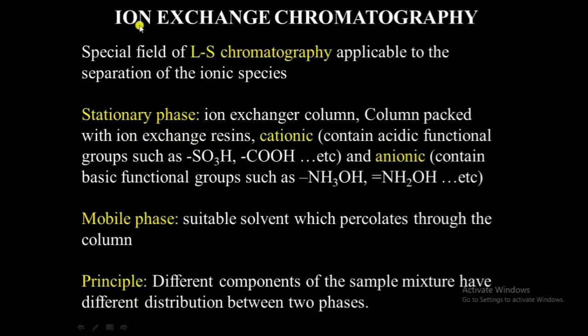So first we will see what ion exchange chromatography is. From the term itself, ion exchange, we can understand that an exchange is taking place between ions. It's a special field of liquid-solid chromatography which is applicable for the separation of ionic species. Here, the stationary phase is an ion exchanger column. So, an ion exchanger is packed in a column.